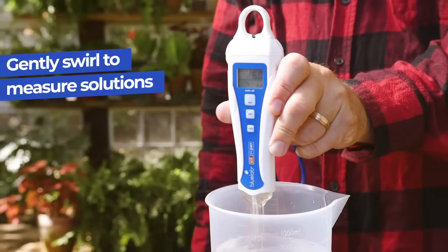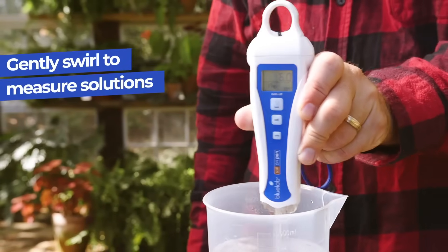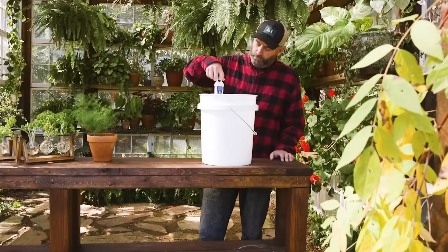Compatible with coco or rock wool, no slurries are needed when measuring solutions. Gently swirl the tip for accurate results.